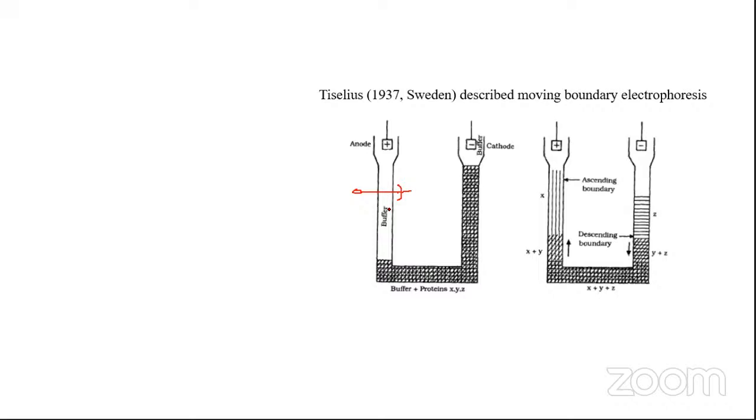Because of a certain degree of scattering of the laser light created by the presence of X molecules here, the detector will start to detect a decrease in the intensity. And that's the boundary that you can detect. Imagine now X is mixed up with Y and it also arrives somewhere over here.